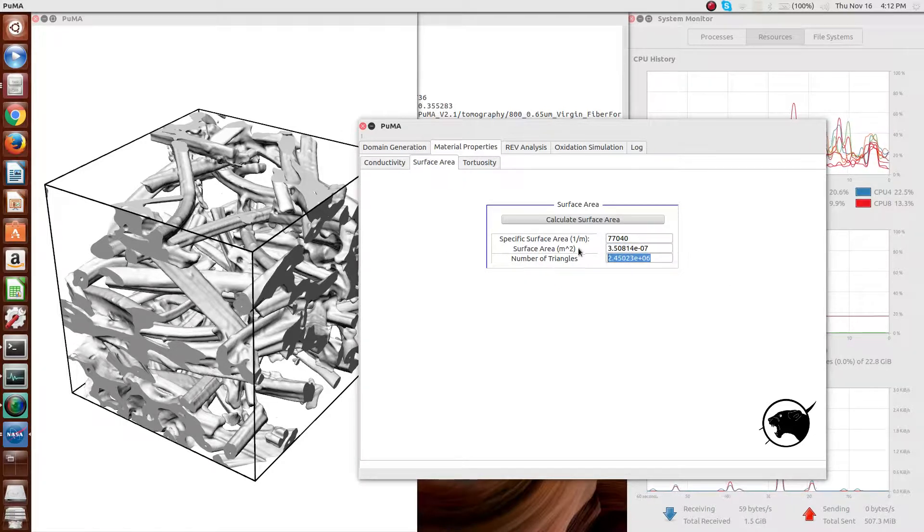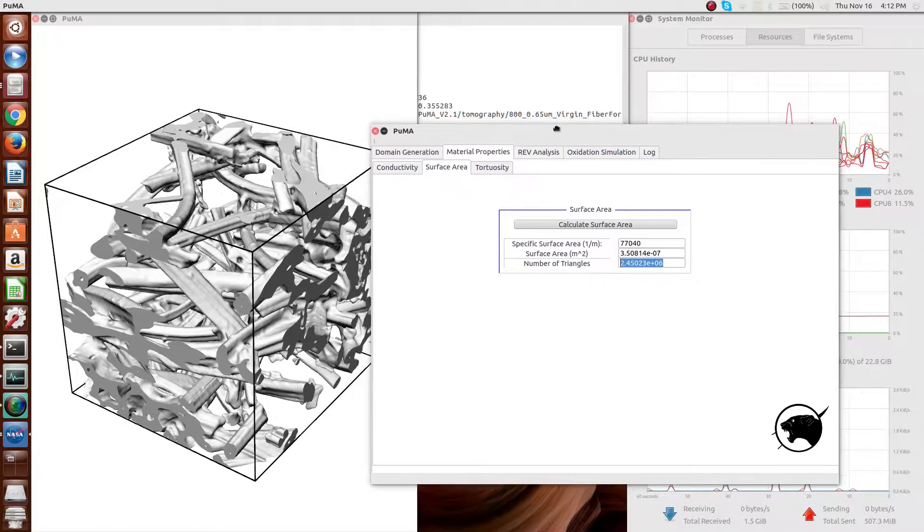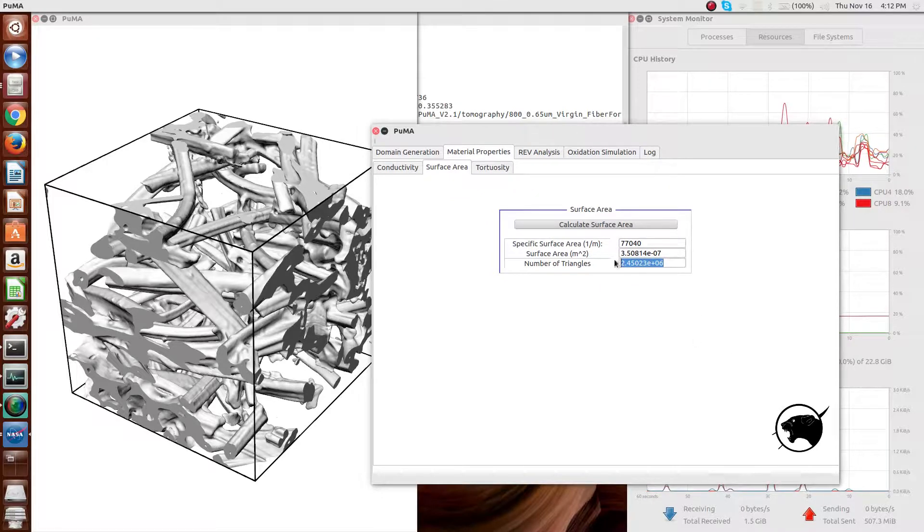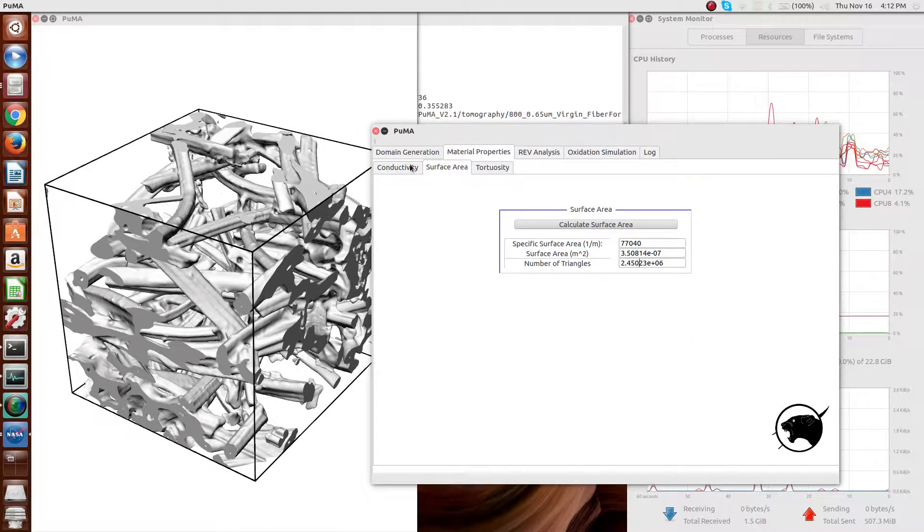And as I mentioned earlier, a few million triangles, this is 2.45 million triangles.